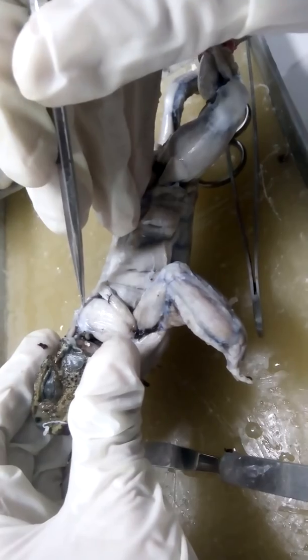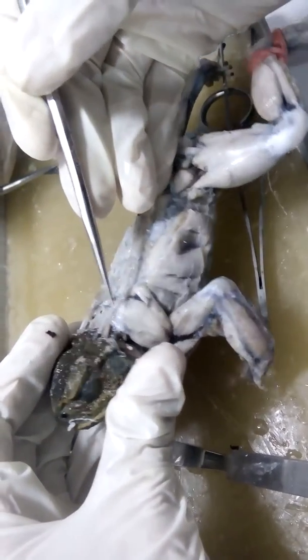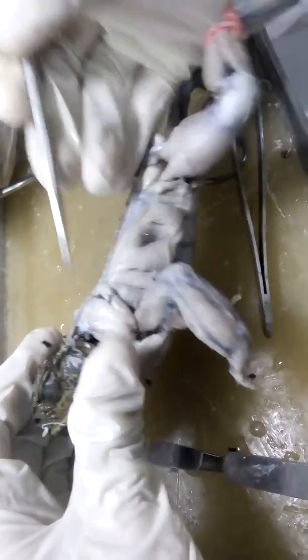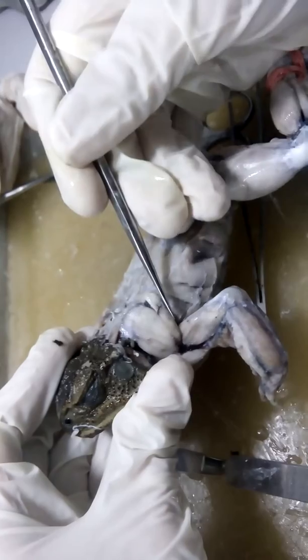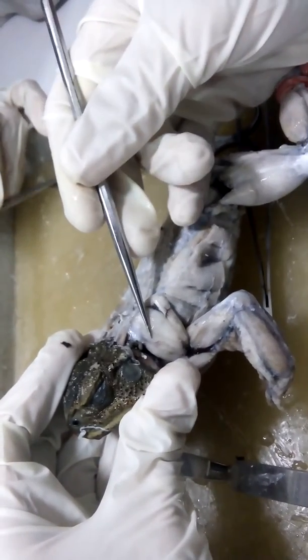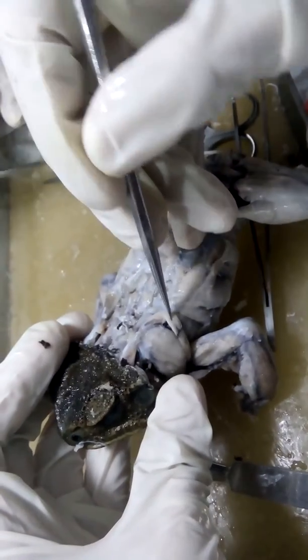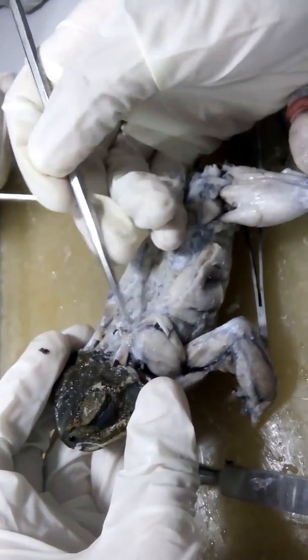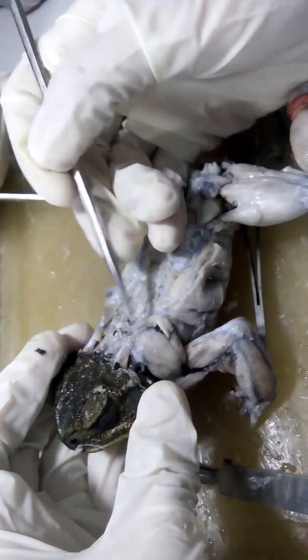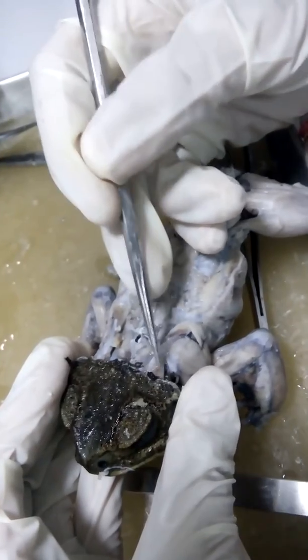Remember the suprascapula of the pectoral girdle of your frog. This one right here, just below your dorsalis scapula, would be your latissimus dorsi, which is continuous with your trapezius. From the word trapezius, triangular sila.